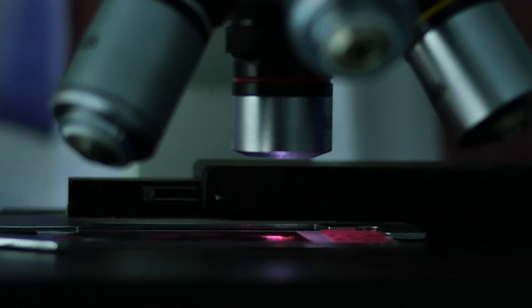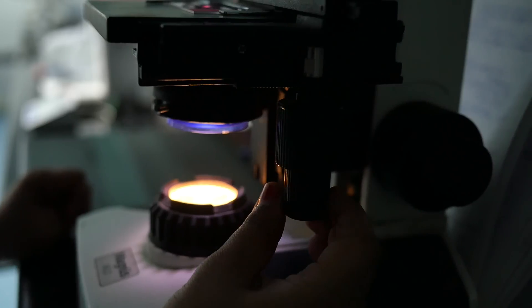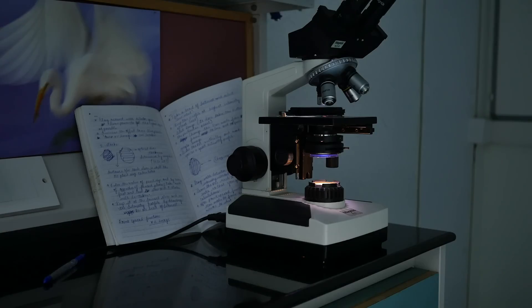The kind of relationship most college students or school students have with microscopes is typically going to your school laboratory and peering under a scope which is poorly aligned and being used by many people. You don't know the optics, you don't know how it works. And that's a tragedy, because you don't get a chance to have a microscope of your own to explore.